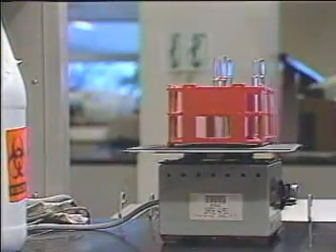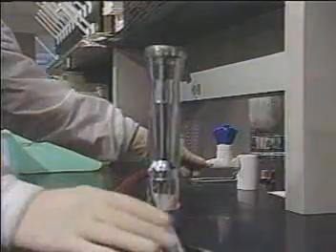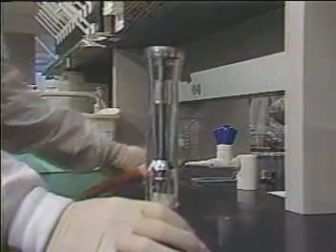Do your best to remove equipment that causes heat or sparks. Equipment such as stirrers and pumps can cause problems. Never use an open flame or a hot plate to heat flammables. Use instead a heating mantle or water bath.